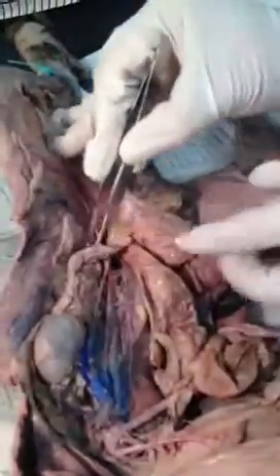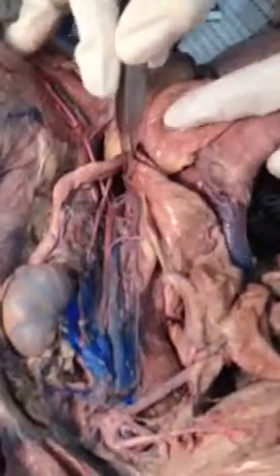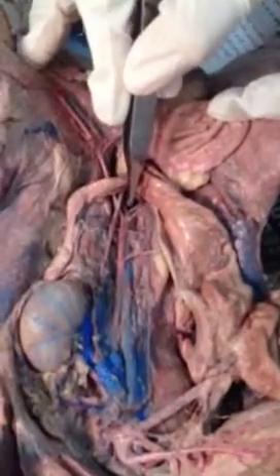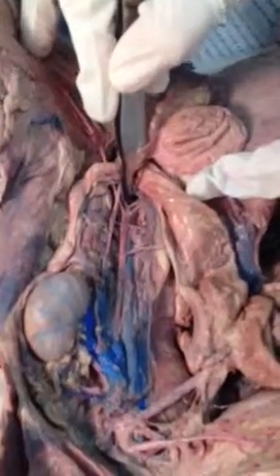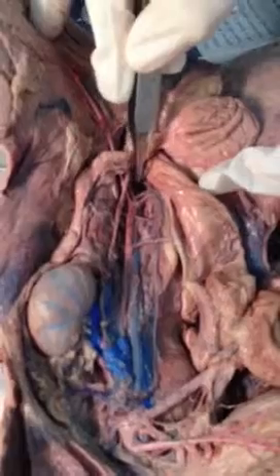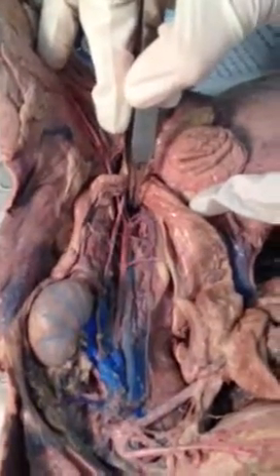And then if you move this a little bit, you can see here nicely the external, internal iliac. Can you see the 2 inverted V-shaped structures there? Yeah. External iliac, internal iliac. Caudal is deep inside where I'm pointing. You have to actually come and look from this angle. Right there where I'm pointing inside. That's your caudal artery. And this is your vena cava, the inferior vena cava.